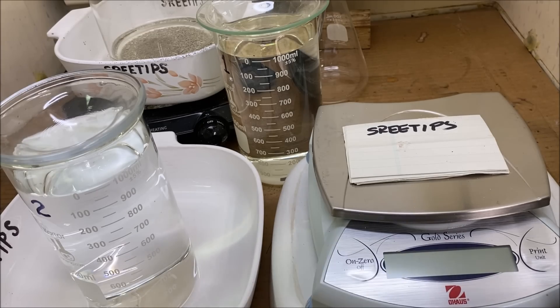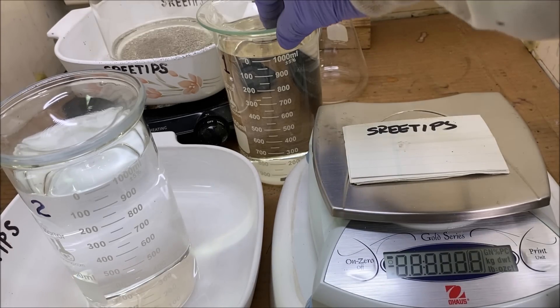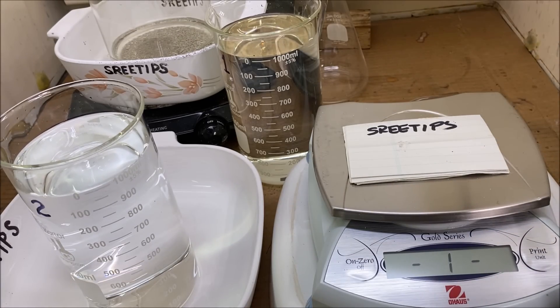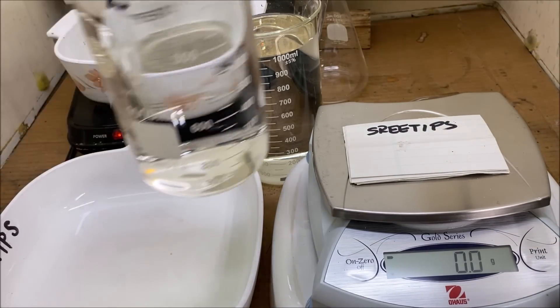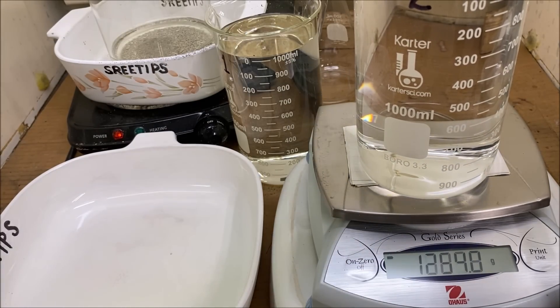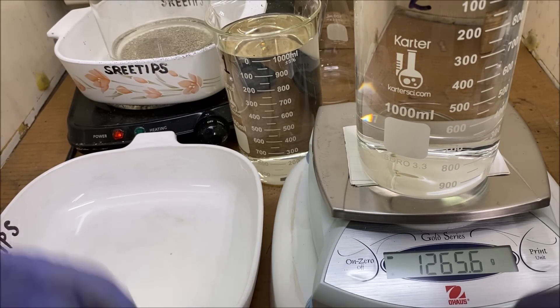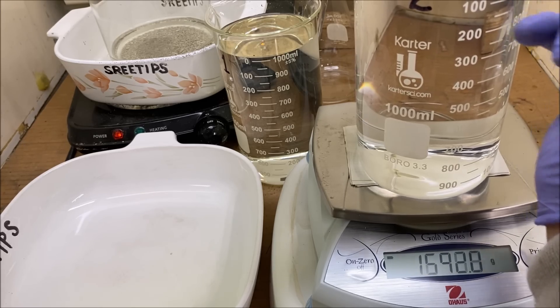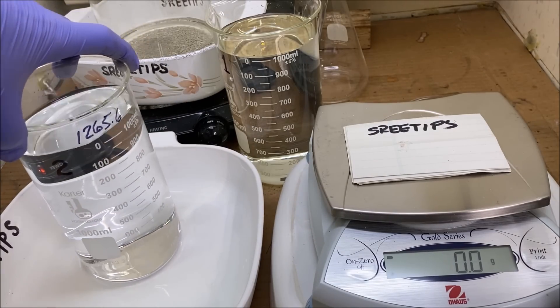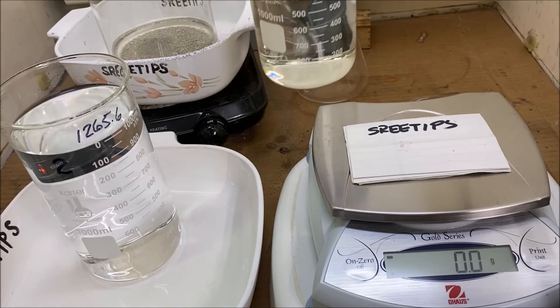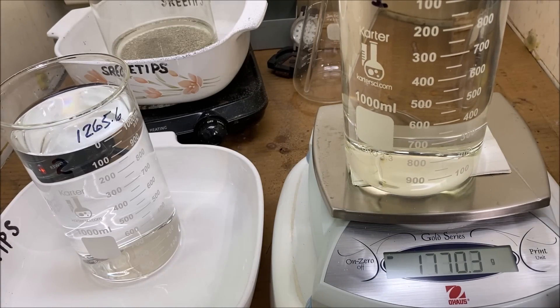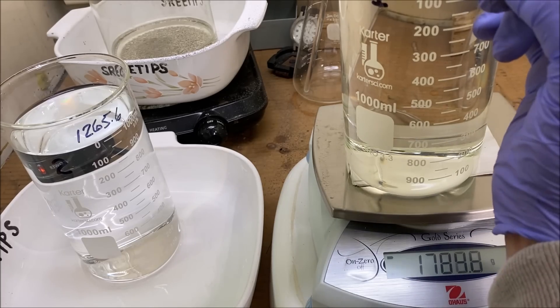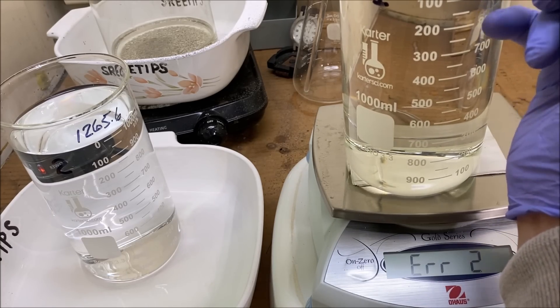Okay, to be totally accurate I should have measured the empty weight of each beaker, but this should be enough to give us an idea of the different density between the distilled water. Let's put that on the scale here. That's 1265.6 grams. Now let's measure the electrolyte. That's 1784.8 grams.